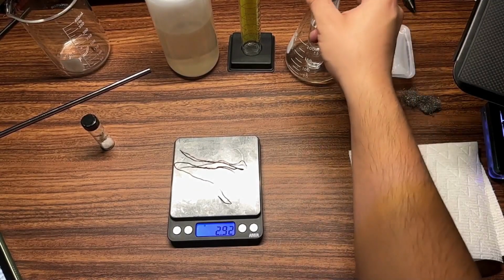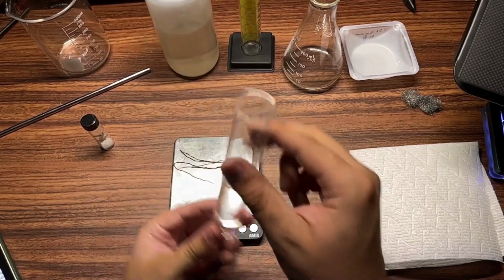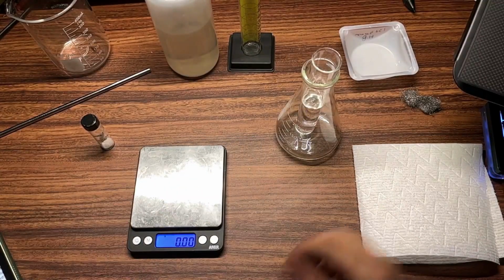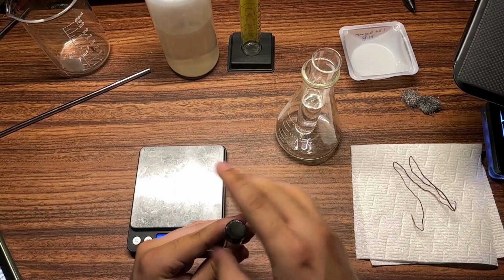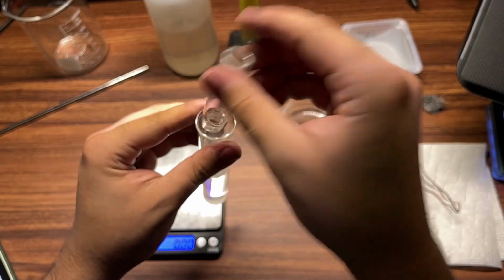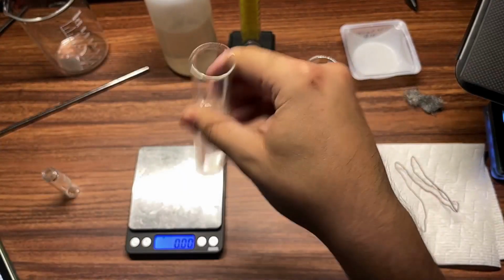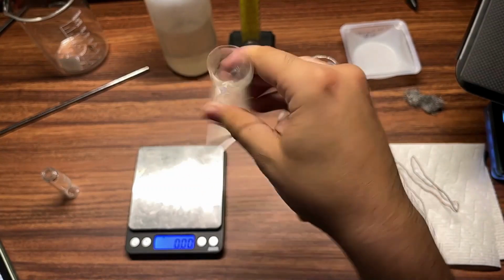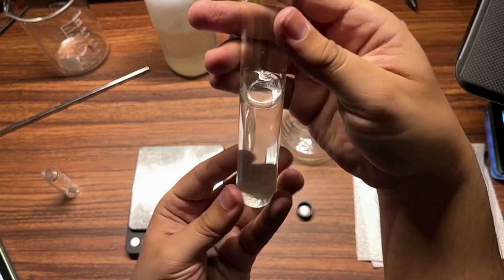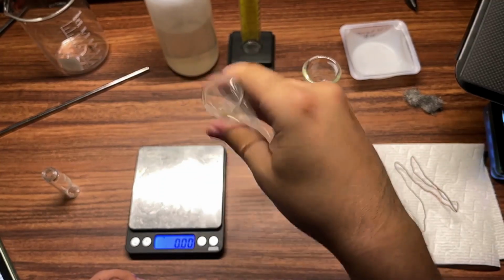Great. Next step, we can get our reaction going, but we got to make our solution of silver nitrate first. This is my water. I already measured it out. The flask is just to keep the test tube from spilling over. And now I need to add my silver nitrate to my test tube. There we go, just like that. And now I need to swirl this until it dissolves, which shouldn't take very long at all because silver nitrate is highly soluble in water, which means it dissolves really easily, and you can dissolve a lot of it in just a small amount of water. So this should dissolve fairly quickly.